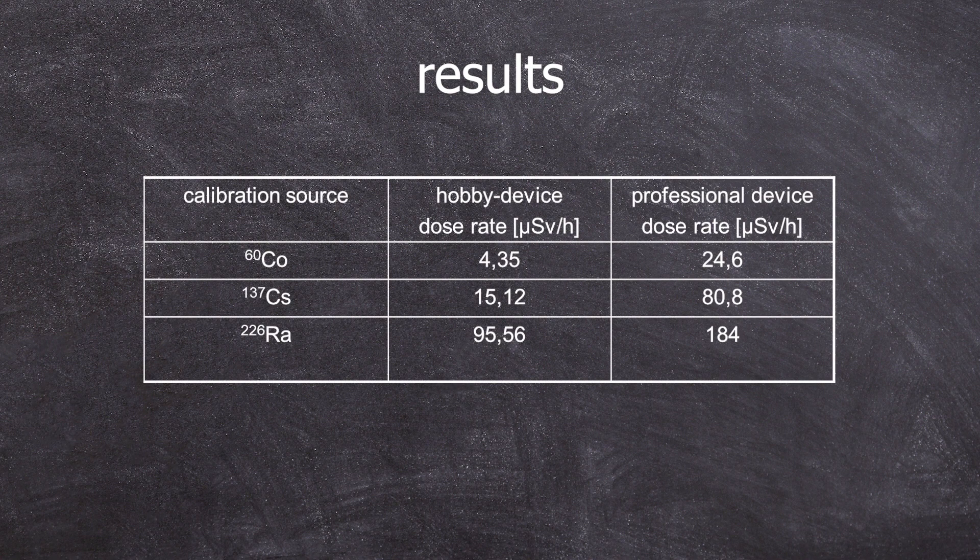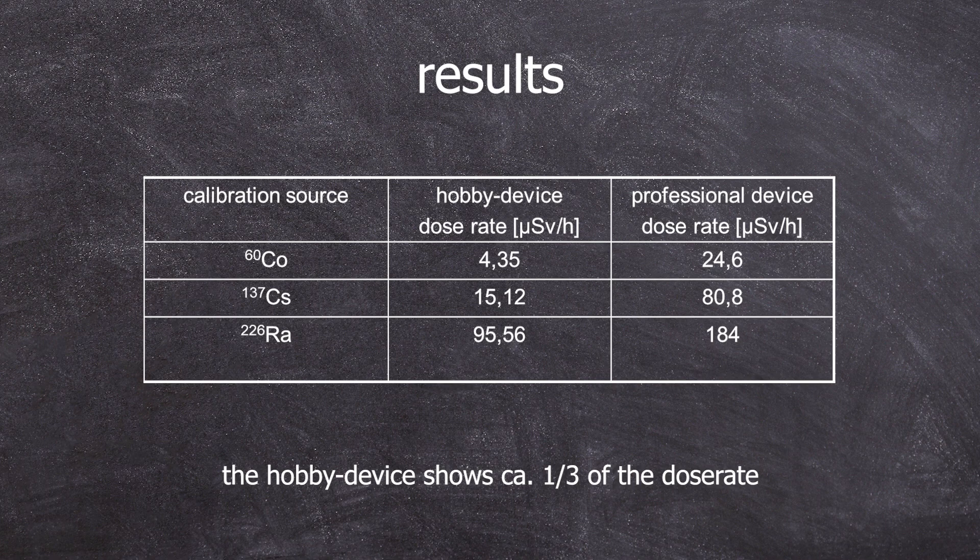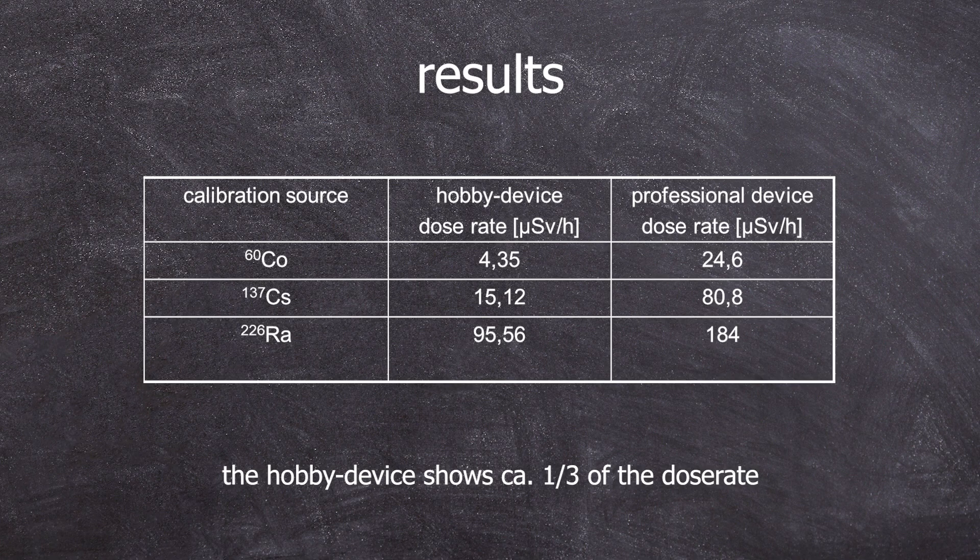If I calculate the average of the values, I can conclude that the hobbyist measurement device measures about one third compared to the professional one. This is quite important. The actual dose rate could be three to eight times higher than what it shows on the cheap device. Well, wait, summarizing it at one third is a bit too rough.